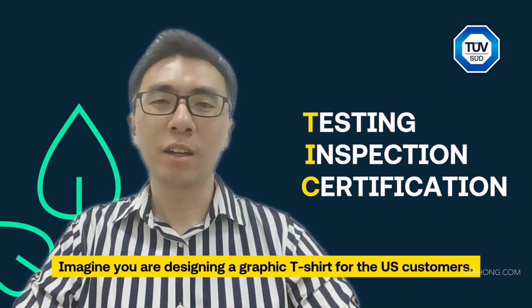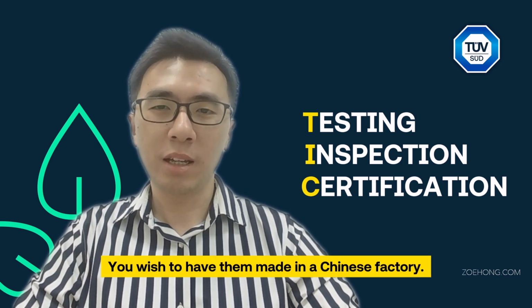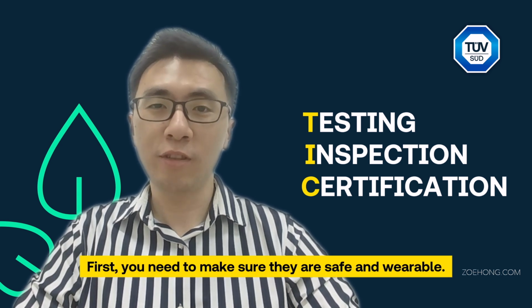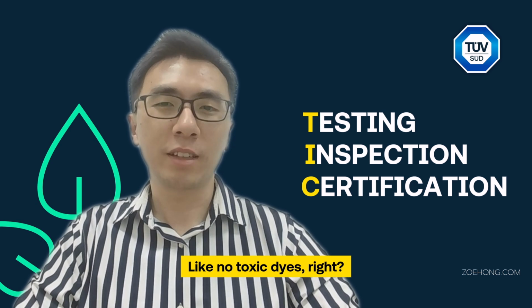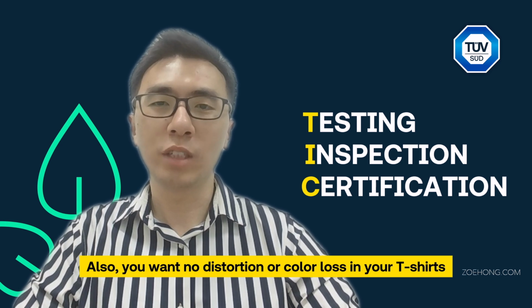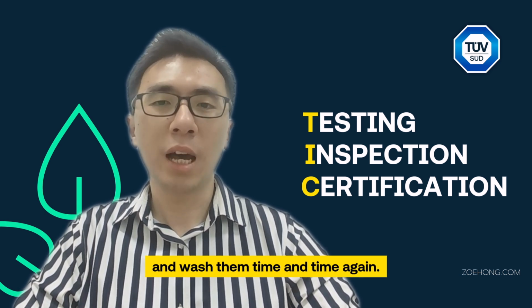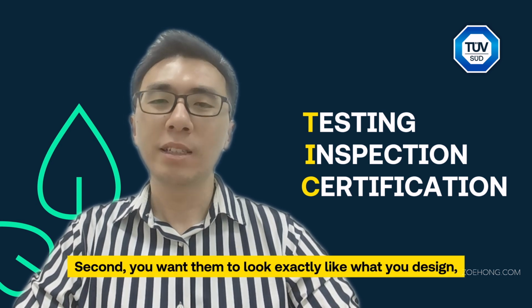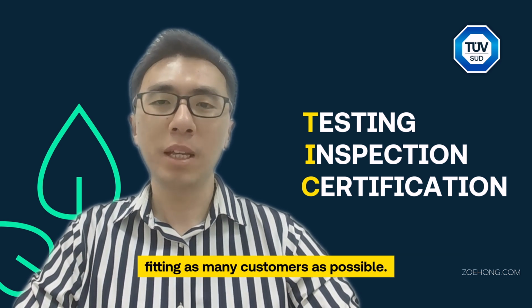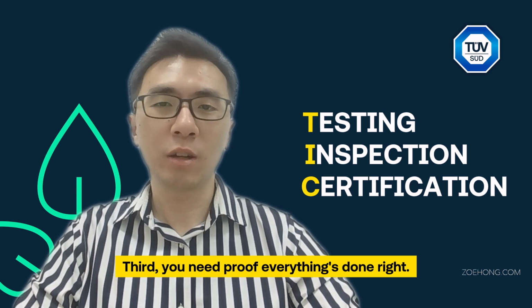Imagine you are designing a graphic t-shirt for the US customers. You wish to have them made in a Chinese factory. First, you need to make sure they are safe and wearable, like no toxic dyes, right? Also, you want no distortion or color loss in your t-shirts when customers wear them in sweat and wash them time and time again. Second, you want them to look exactly like what you design, fitting as many customers as possible. Third, you need proof everything's done right.